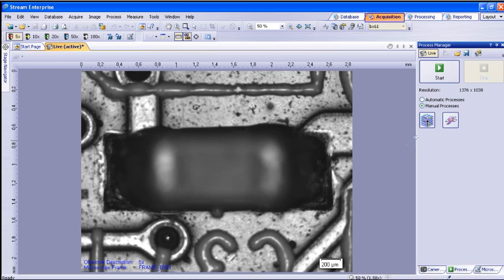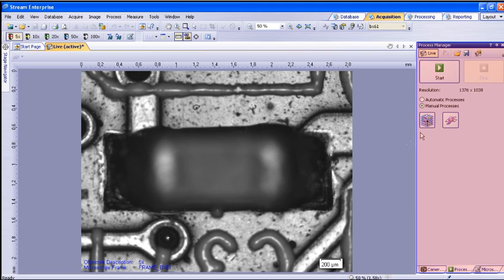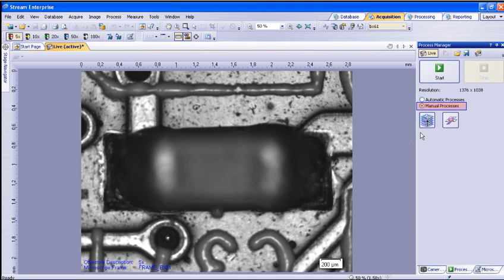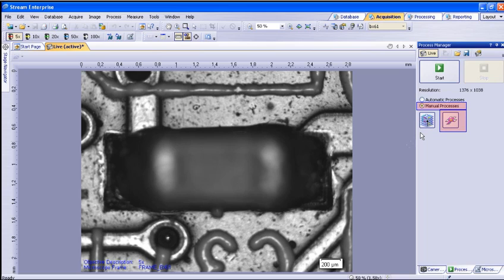To begin, you will need to have a live image within the Acquisition tab, and interface with the Process Manager tool window. You will need to select Manual Processes. The manual processes contain EFI, extended focal image, and MIA, multiple image alignment.